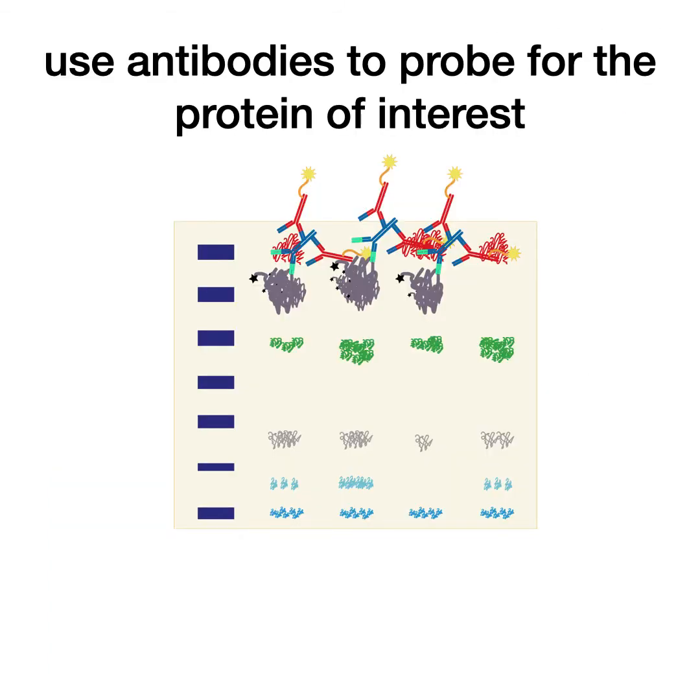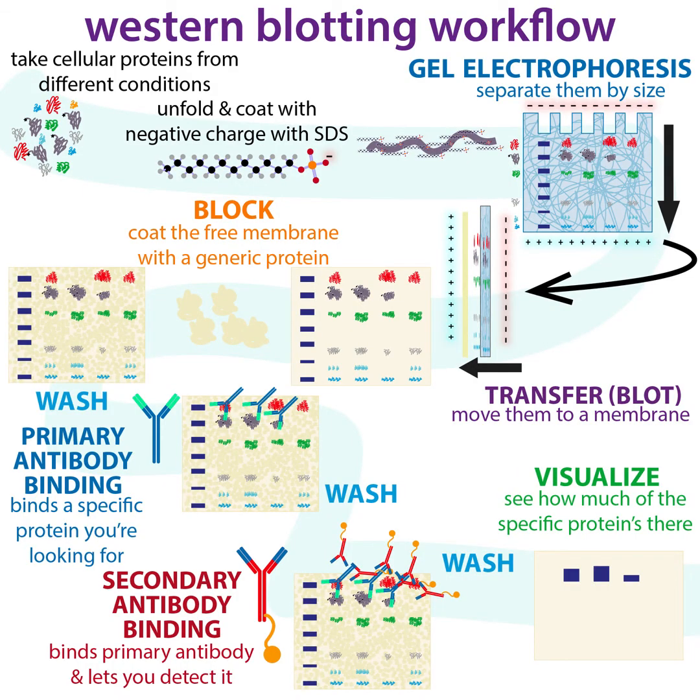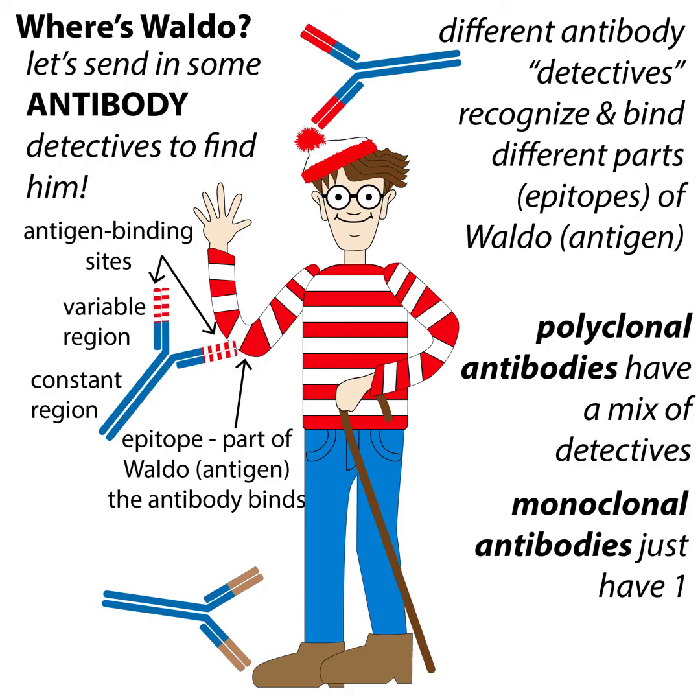Then to find that protein of interest, you're going to use antibodies. So now we're at this stage. An antibody is basically a little protein that recognizes a specific part of something else. We call that something else an antigen, and we call the part that gets bound by that antibody an epitope. We say recognize, but really that just means that they bind specifically to it, or you hope it's specific. Sometimes they can be non-specific, and then you can get noisy signals.